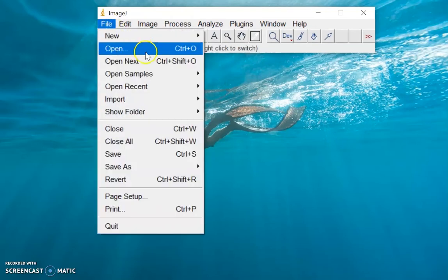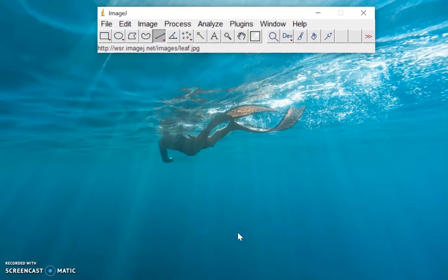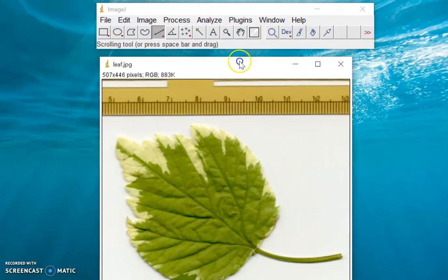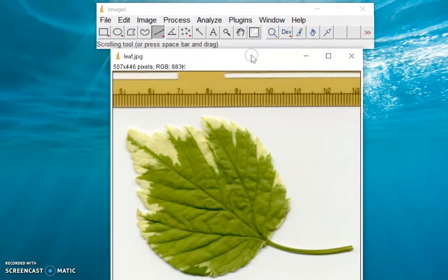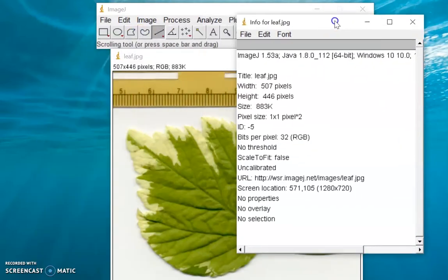So let's try to open first a sample image. I will open the leaf sample image. So we have now this sample image from ImageJ. What we can do first is click I on our keyboard and this will give us the metadata about this image.